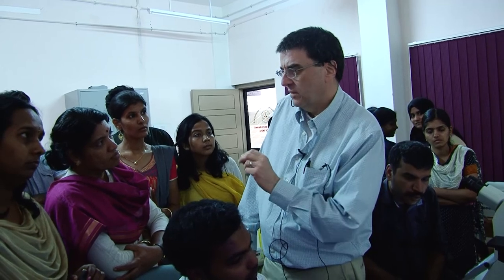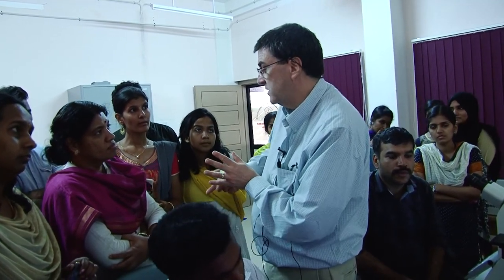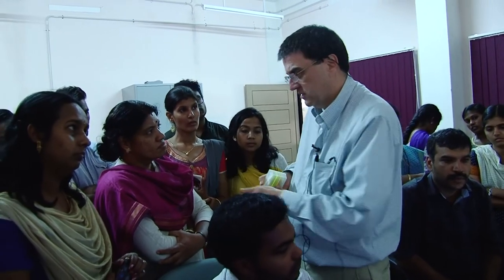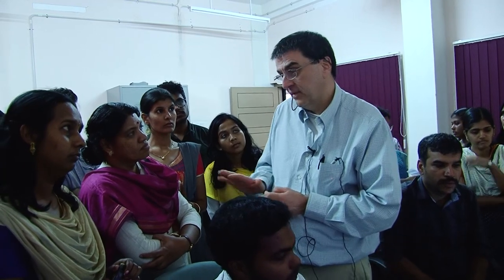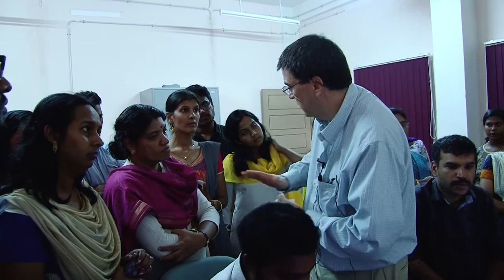But I try to avoid blue fluorochromes. They just in general aren't as good. So I try to stay with my greens and my reds. The blue ones just aren't as good. Although I've seen a new one came out, just came to my lab in the last few weeks, called Brilliant Violet 421. It's a flow dye, but it seems to work pretty good for the microscope. But try to avoid the blues if you can.